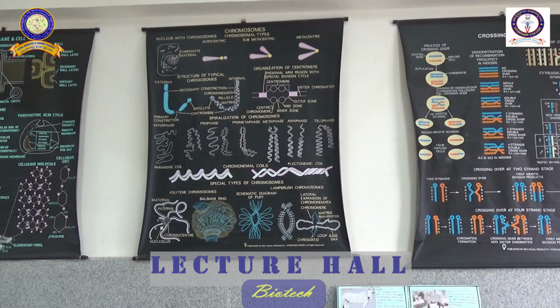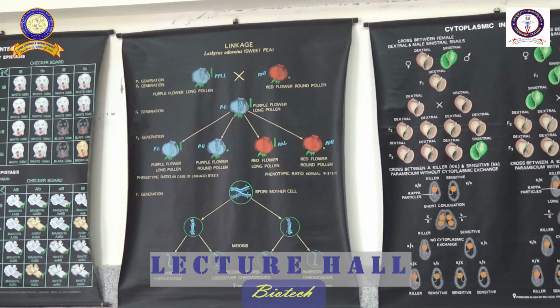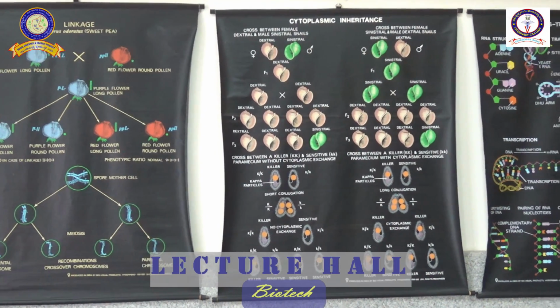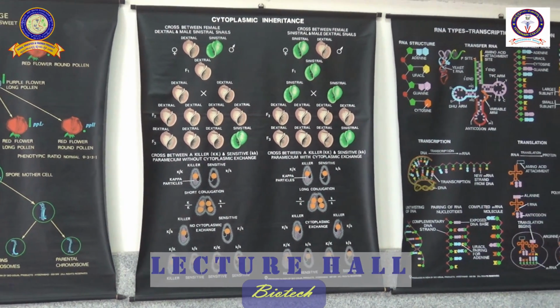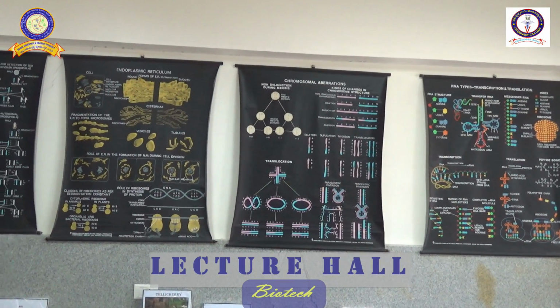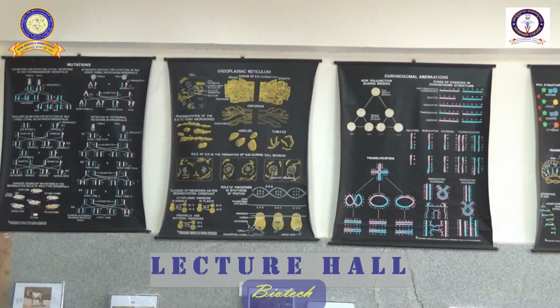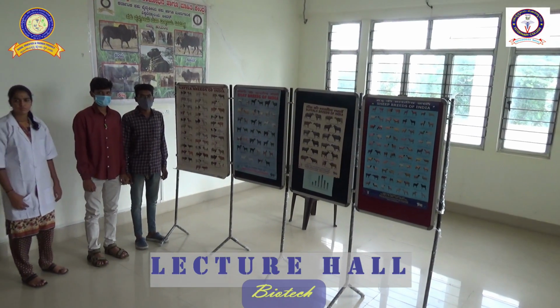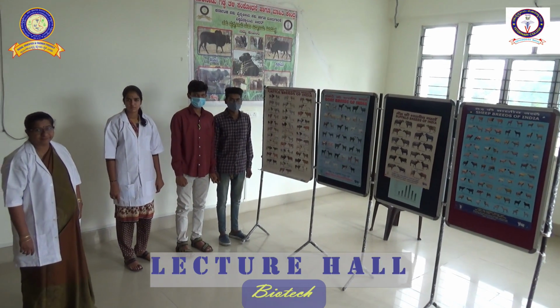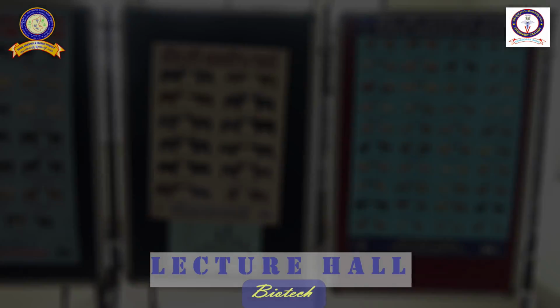Coming to the biostatistics part, we teach basic statistics and also train the students in analysis using simple software, and our lab is equipped with some bioinformatic tools to analyze genetics data. With respect to molecular genetics, we do experiments on DNA isolation from different species.